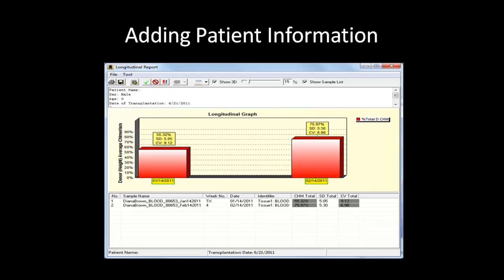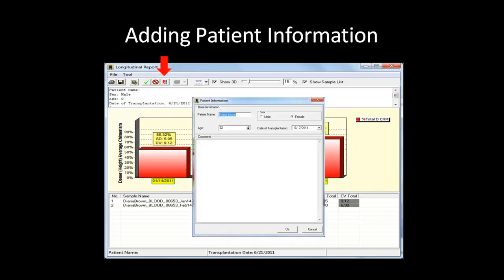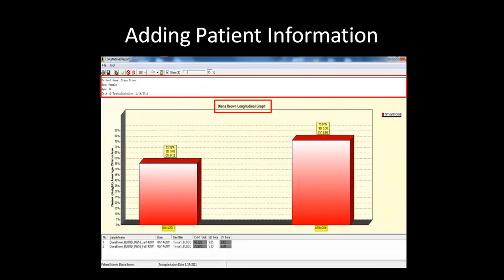To add basic patient information to the longitudinal report, click on the icon as shown. This will bring up a dialog box where you can enter information such as name, sex, age, date of transplantation, and comments. Click OK once you are finished. The patient's name will be populated in the title, and all information entered will be displayed in the top pane and saved or printed with the report.